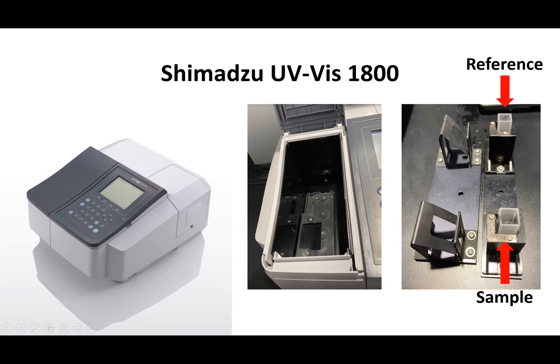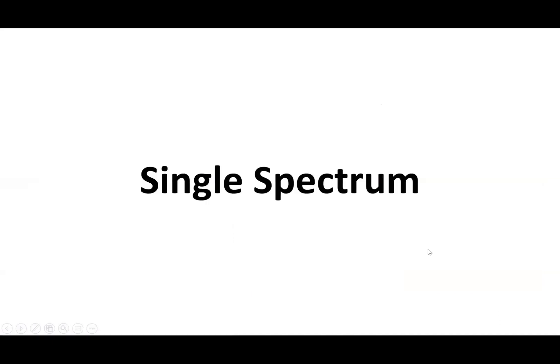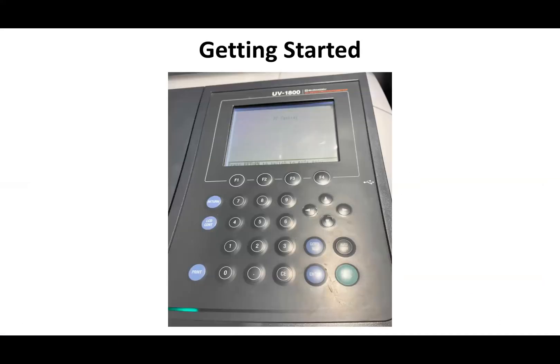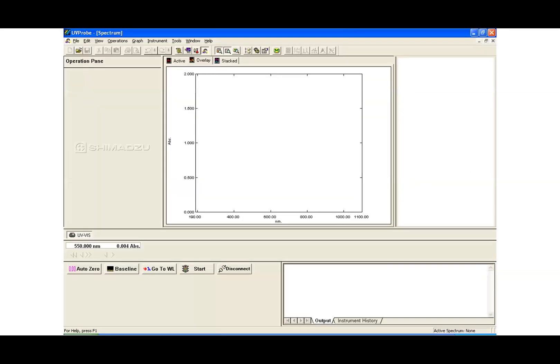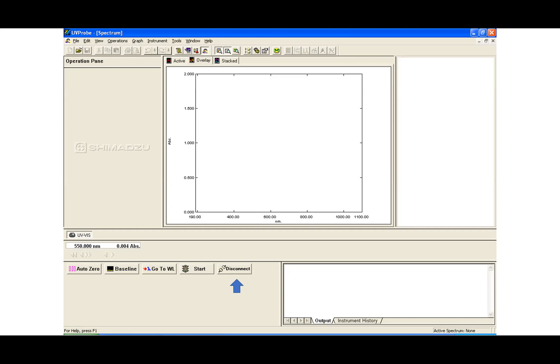To take a single spectrum, first you want to press F4 in order to have PC control. Then you go into the computer and there's this software called UV Probe, it's on the desktop very easy to find. After that you just have to click on Connect. Here I had already connected so that's why it says Disconnect, but it would show up as Connect as soon as you click F4 on the instrument itself.